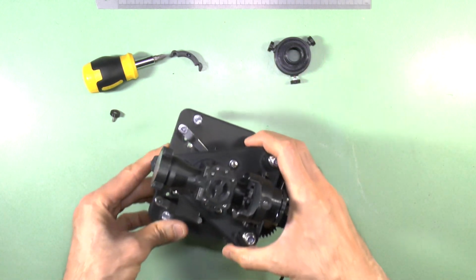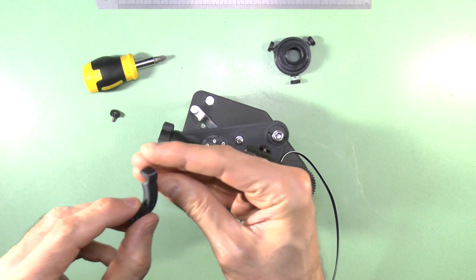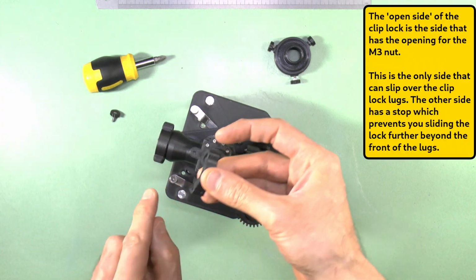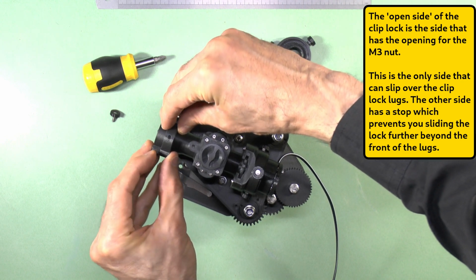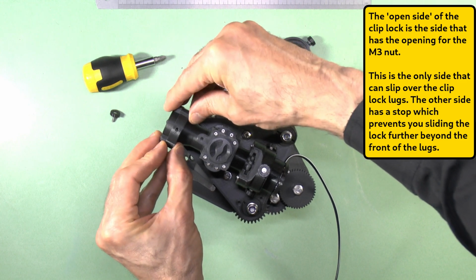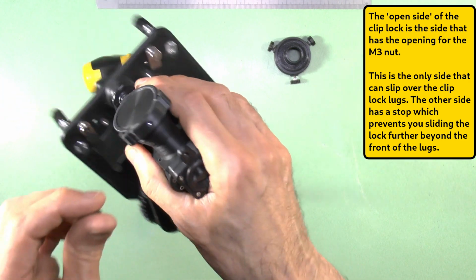You can now slide the clip lock over the clip from the front, ensuring the open side of the clip lock faces the lugs on the clip. And lock the system in place by means of the thumb screw.